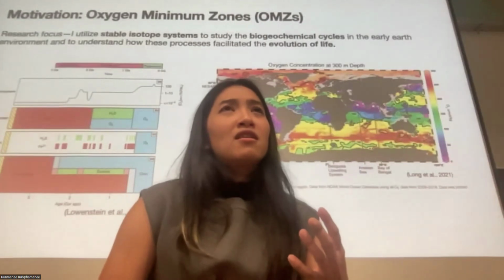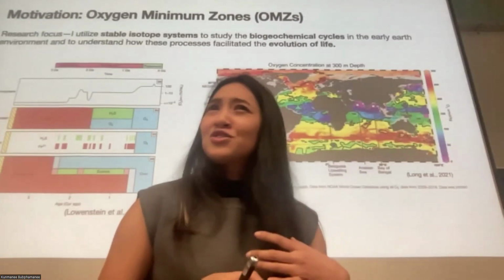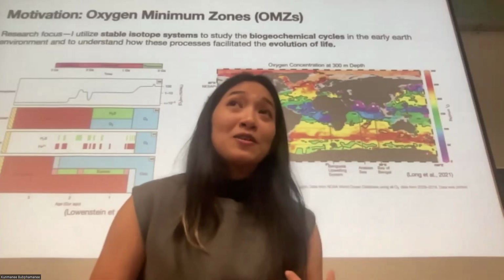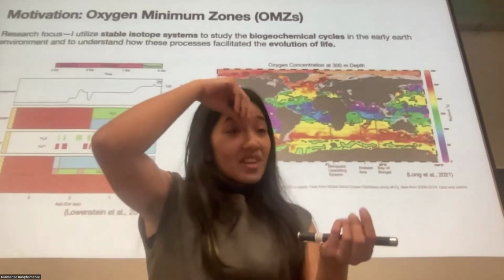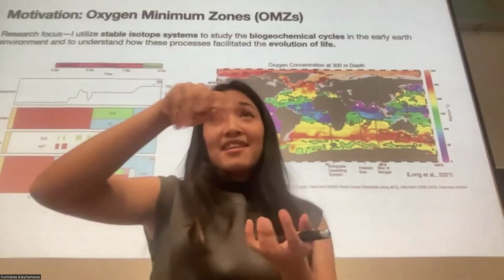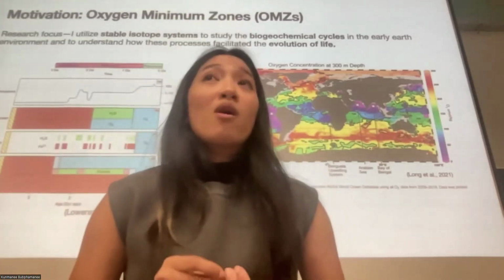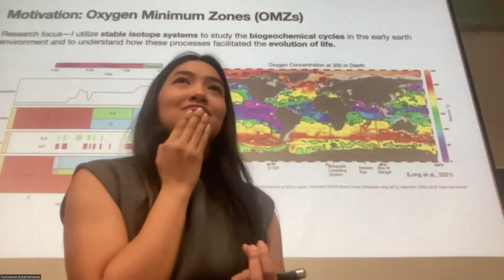It might be harder to culture them in low oxygen, but we try to maintain it by capping the bottle. But again, it's not a purely no oxygen environment.